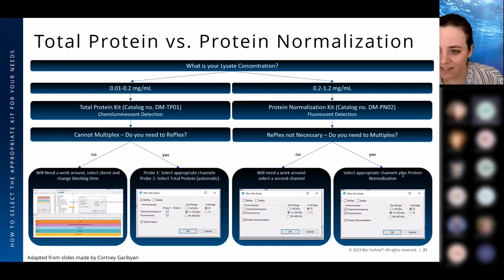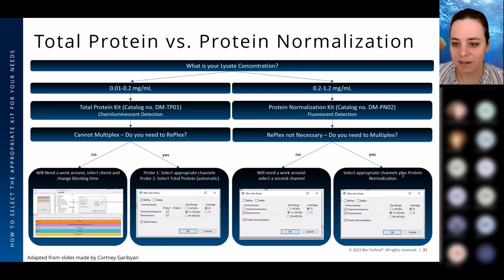Yeah, we have tried it, and there's variation that I did not anticipate, which is why I asked the question. So what I'm hearing is 15% CV is what you would expect, and I think that's reasonable. Yes? Okay, thanks. Although I think some of the other people may have a little bit more experience with doing that across the board, but that's what I've seen just in general.